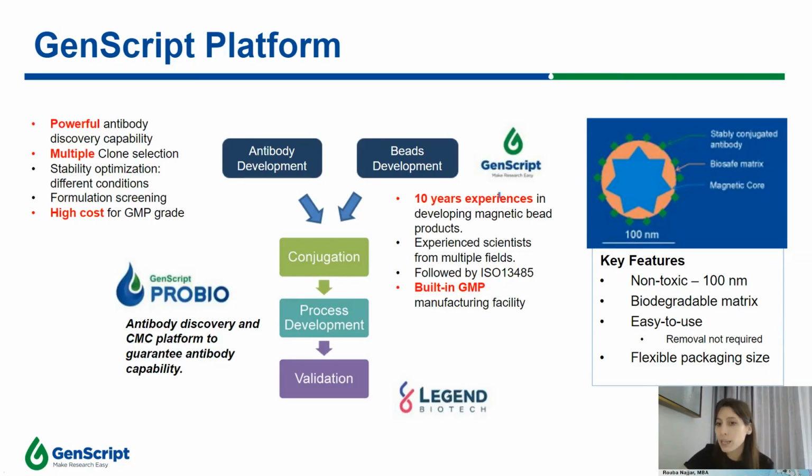And so to the right-hand side, I do want to mention that this is a quick overview of the structure of the magnetic beads. You can see that the actual bead is fairly small, about 100 nanometers. The matrix of the bead is non-toxic, so it is biodegradable. That means you do not need to remove it at the end of the purification. The cell will actually get rid of it on its own.